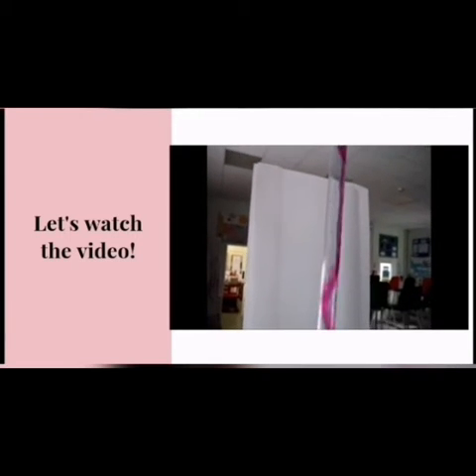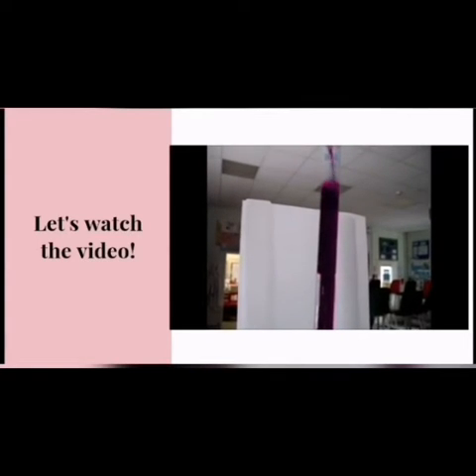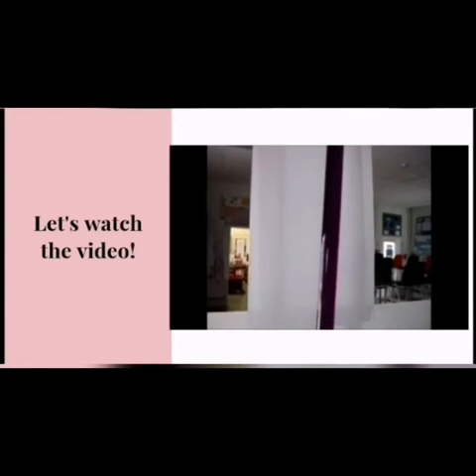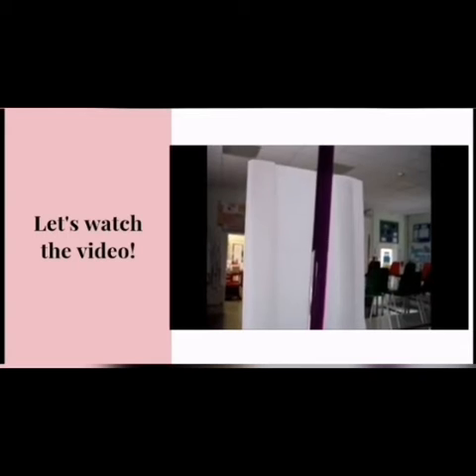The burette was filled with the potassium permanganate solution. Make sure the tap was closed when filling it and there are no air bubbles trapped at the tip. The filter funnel was removed afterwards to ensure the fill level remains constant. The initial burette reading was recorded to 2 decimal places.